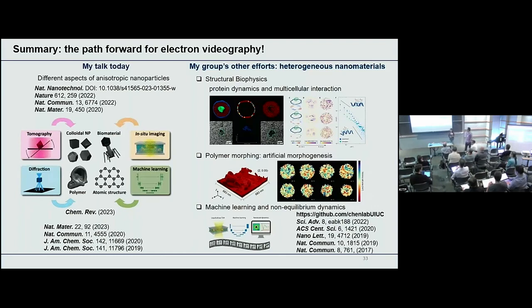It's a beautiful talk. Thank you for that. I have a question about the layer by layer growth part. Typically, at least in atomic systems, the transition between layer by layer growth and continuous growth is a roughening transition, which also in non-growth conditions results in a faceting transition of the collection of particles. So I wonder if you've been able to correlate the transition between layer by layer growth and continuous growth to the overall morphology of the particle.